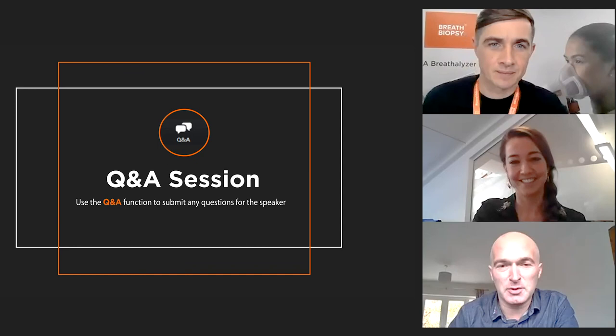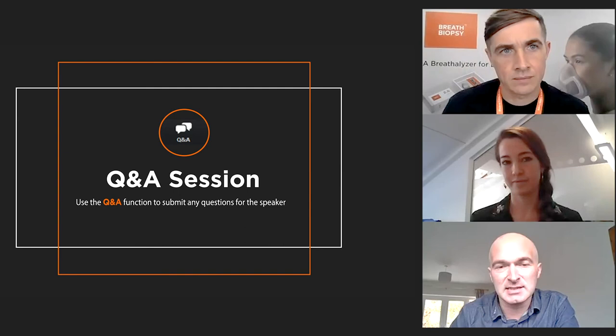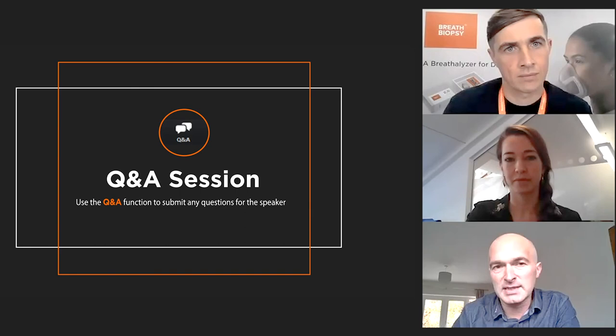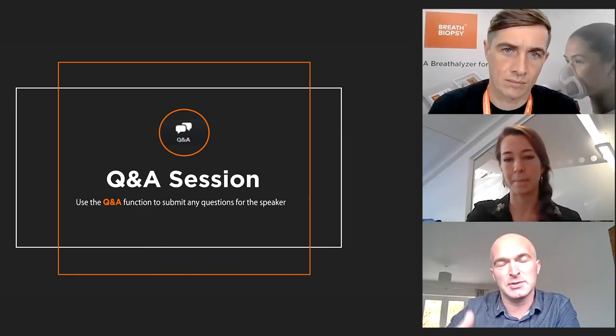With regards to the GC Orbitrap and the studies at Owlstone, I know they were acquiring data at 60,000 mass resolving power. And that's acquired at 7 hertz, so 7 spectra per second. And I think across a 3-second GC peak, that's going to be giving you between 20 and 30 points across that peak. And you're right, that level of acquisition rate will give a good level of deconvolution to extract all of the peaks from the data. A way to test that would be obviously to have a blank and then add known compounds to a sample. And then because you know what you added, you should be able to detect those incremental number of compounds in the standard. So that's how I would do that.